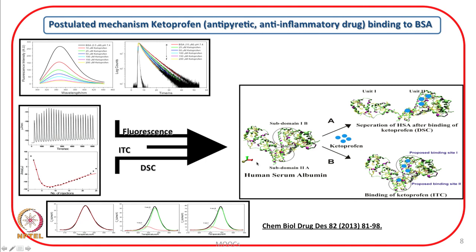For further details on the mechanism, I refer you to this research article. But what I want to highlight over here is that by combining the calorimetric and spectroscopic techniques, these kind of detailed mechanisms can be postulated.